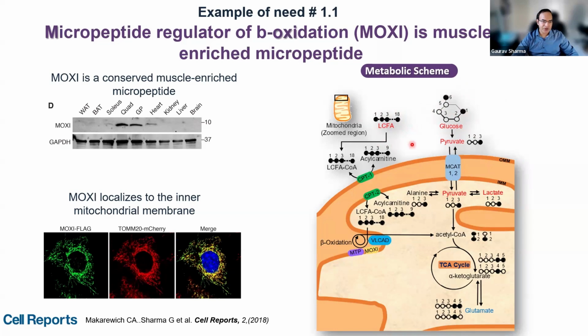I'm going to show you with the arrows. If you look at this red arrow, once it is metabolized, it goes inside the mitochondria, into the TCA cycle, and what we analyze is the glutamate because it is relatively stable and directly linked with the TCA cycle, so it provides very comprehensive information.